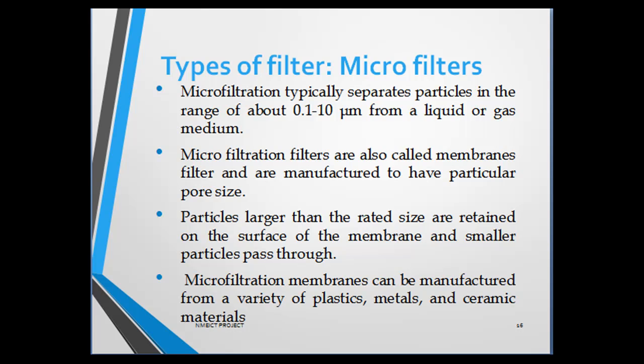What are the applications of microfiltration? First, it is widely used to check the sterility of a product. It can even be used to sterilize heat-labile compounds such as vitamins and antibiotics. It is frequently used to remove contaminants like bacteria, yeast, and fungi from solutions. And above all, membranes can be used in the quantitative separation or filtration of suspended matter from liquids and gases.